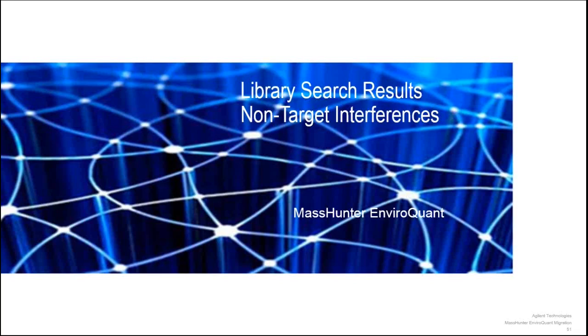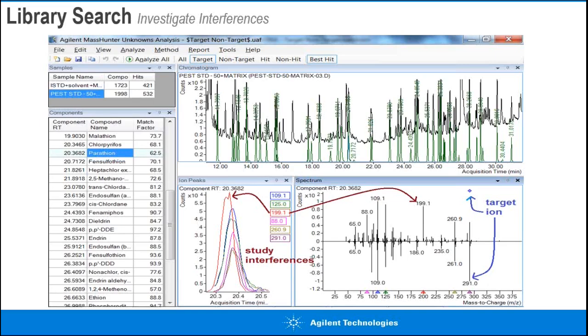All right, I'm doing okay on time, but I think this is the most complicated part that I was going to discuss, and I think I'm going to skip it so I have some time to get to the questions at the end. But we do have the capability of providing you a tool that helps the analyst look at non-target interferences. So I'll just mention this and I'll skip over the demo.